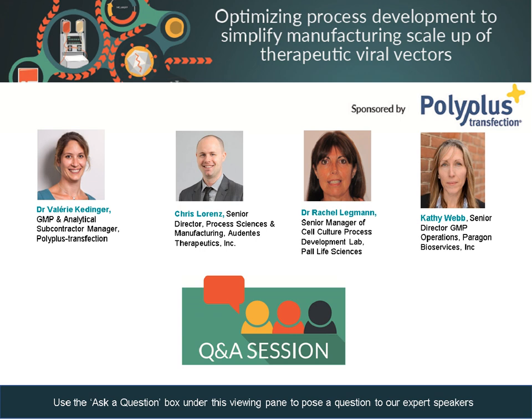I agree with Chris there. It would be nice to have some more analytics for real-time measurements in terms of what's happening in that environment. But for what we have right now in the manufacturing area, we highly proceduralize those steps of what we're doing and how we're performing the transfections, particularly for batches that we're running in different campaigns, just keeping it as consistent as possible. So that means having a consistent mechanism for mixing time, paying attention to the steps regarding feeding, and making sure that everyone understands why things are highly proceduralized, just doing that same thing over and over as much as possible.